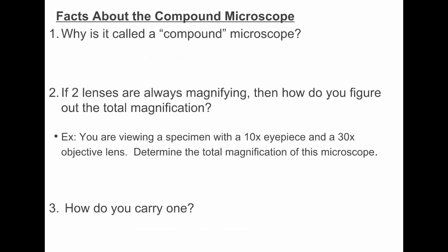All right. So we'll use the dissecting microscopes Monday and compound microscopes Tuesday, Wednesday.